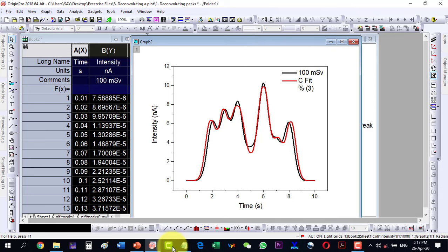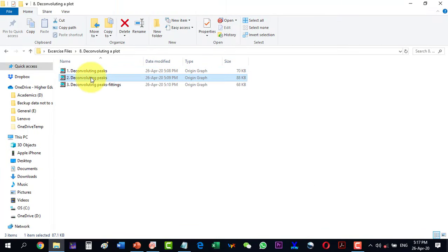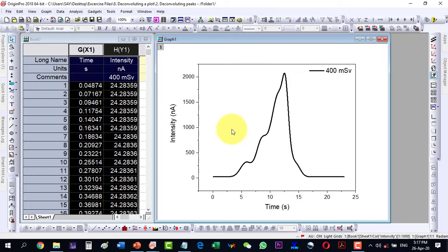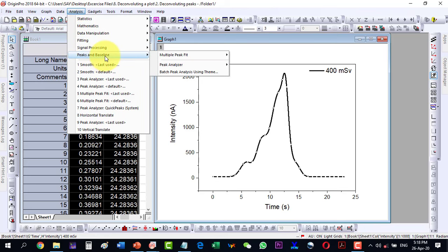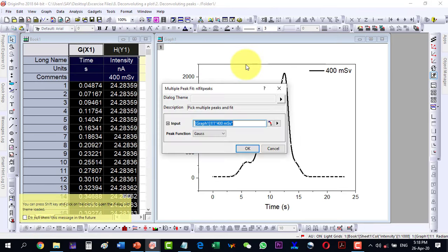Similarly, sometimes the peaks are not very clear. For example, in this plot we can see there is one peak, another, another, and a very faint peak as well. This is a dosimeter response. For a dosimeter we should have a very broad peak from which we can calculate the absorbed radiation. When the peak is like this we cannot decide which peak is the dosimeter peak.